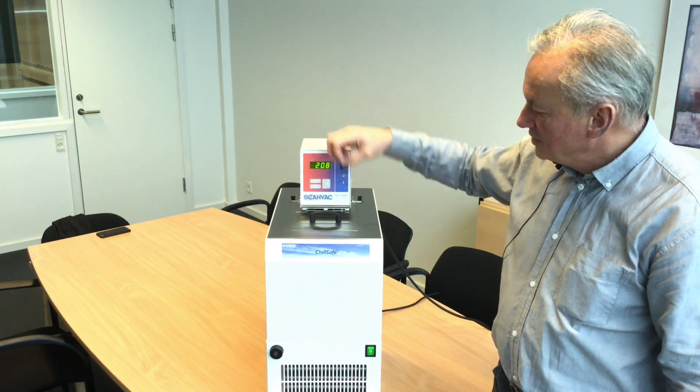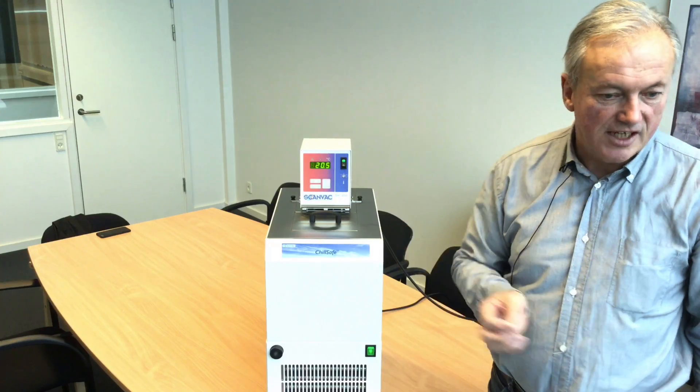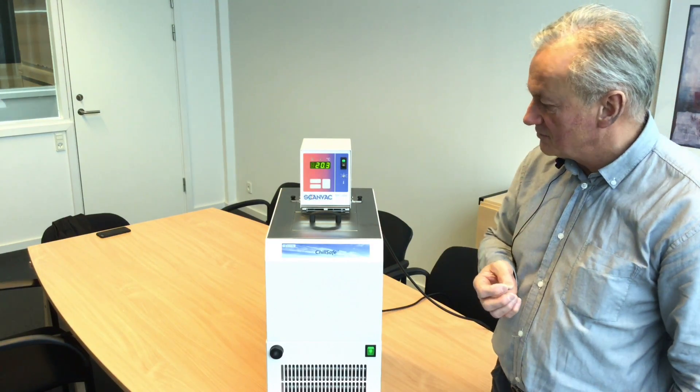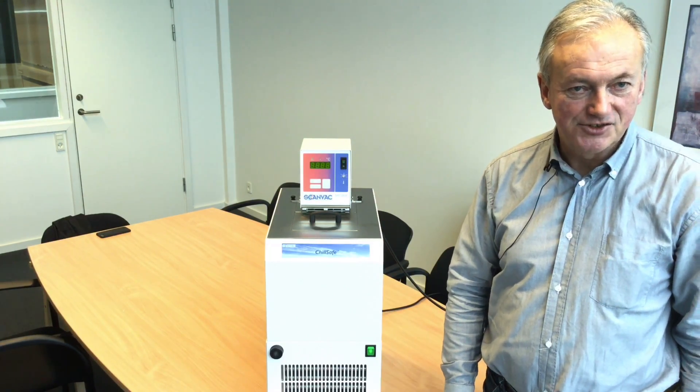The set point will control the liquid temperature in the bath. But you can also put that to the external circulation, so you can use it as a cooling unit for other units which you would like to cool down. Thank you for listening regarding this ChillSafe.